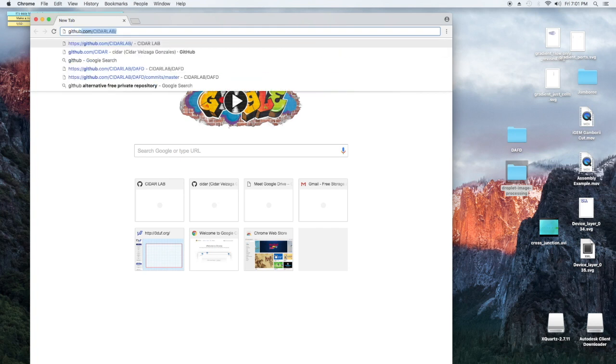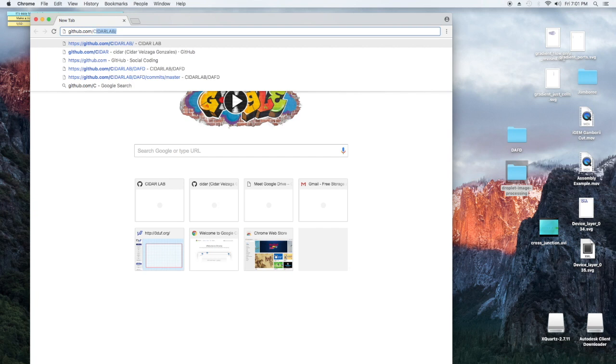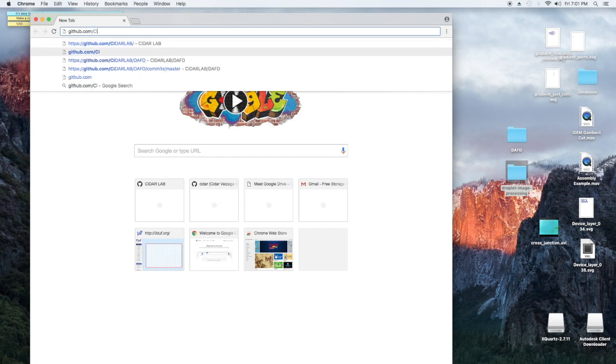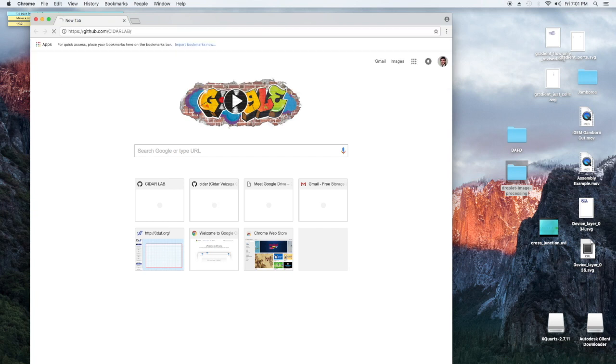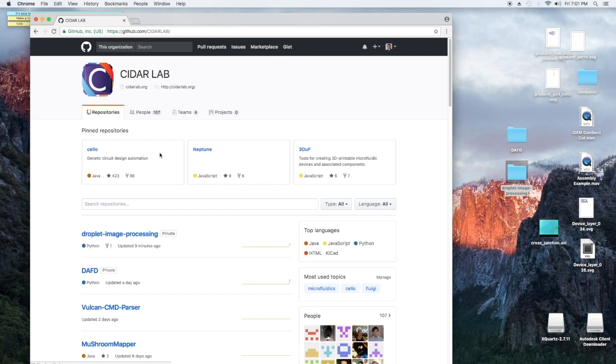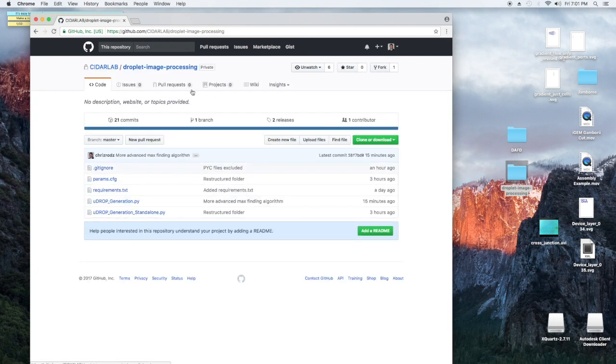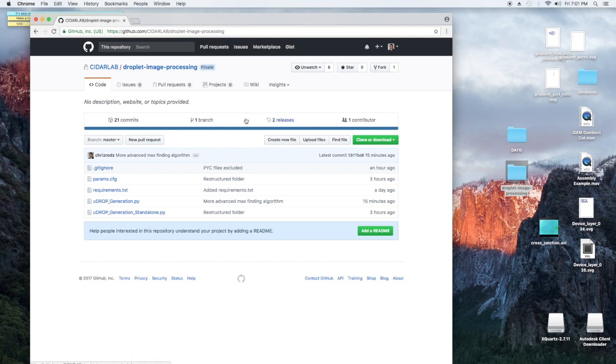First, you're going to want to download the binaries from our GitHub page. We're on CIDR Lab, Droplet Image Processing. Notice that it's a private repository, so you're going to have to get permission from Krishna, but hopefully we should have this public in the near future.